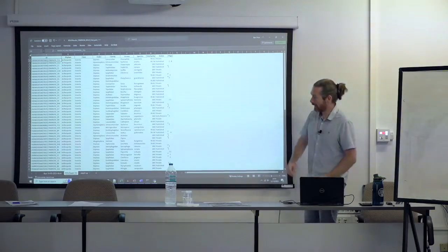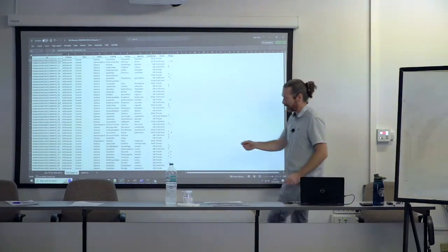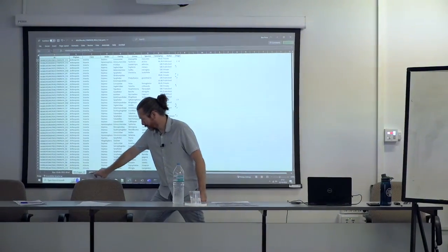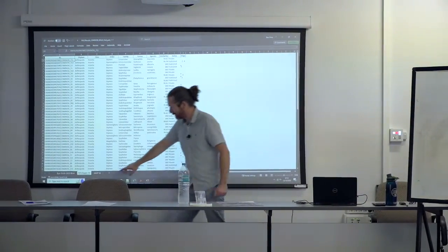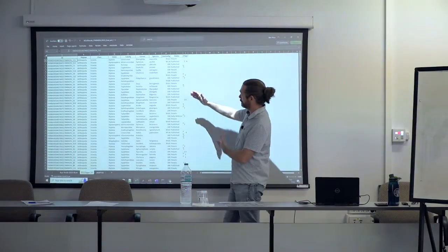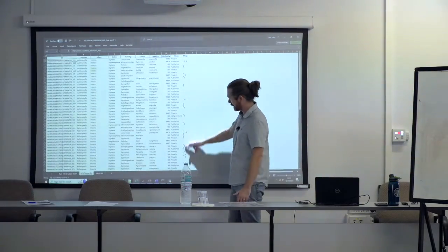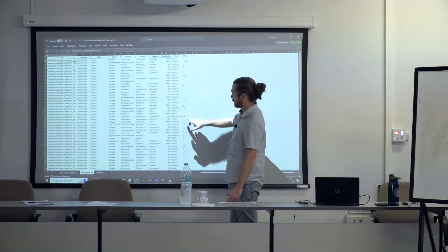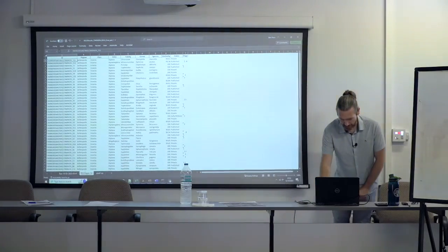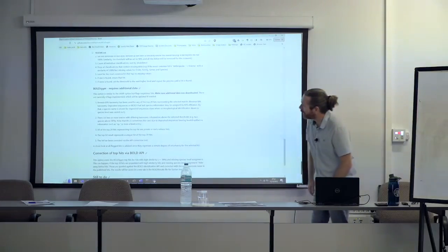And then there's a third tab, so you probably can't see it here, but that was our run data. That was the JAMP hit that I just showed you, and then this is just the BOLD Digger hit version, and it's identical to the JAMP one. It's just added these flags here, and these flags correspond to different things you may want to check related to that match. And I think they are listed here.